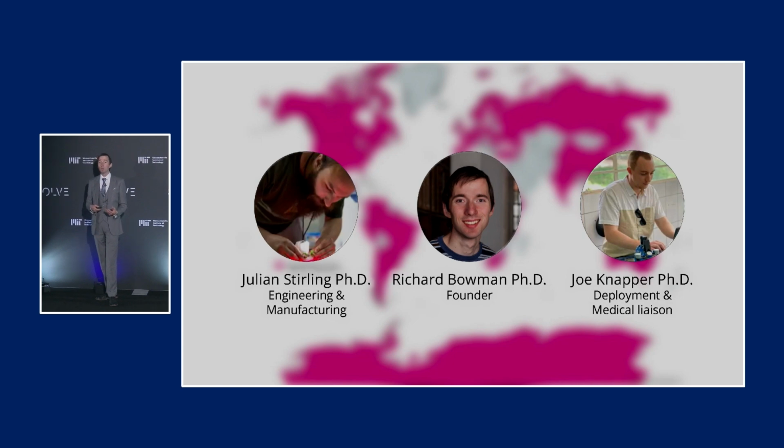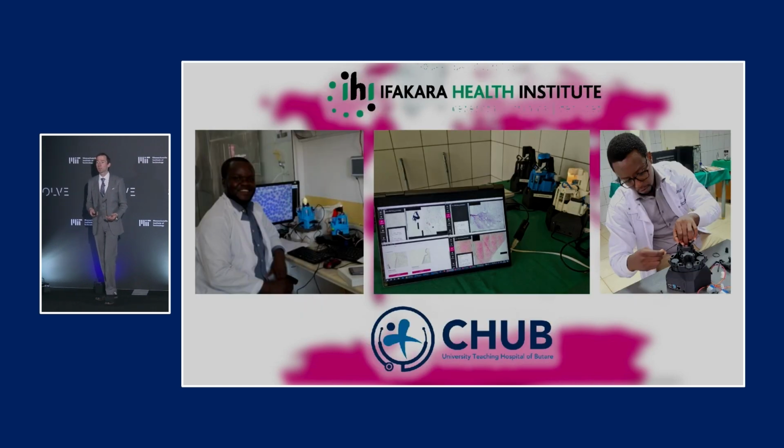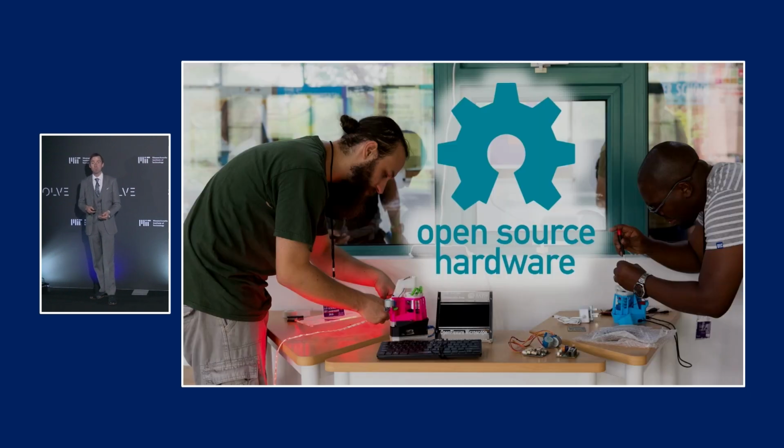The OpenFlexure community has trialed the microscope in Brazil, Rwanda, Tanzania, Cameroon, and the Philippines. And our network includes specialists in breast cancer, cervical cancer, and malaria, as well as local manufacturers like BTEC in Tanzania. These local partners have been on board since the very start, and they're excited to become the first microscope manufacturers in their countries. We have a new business model.